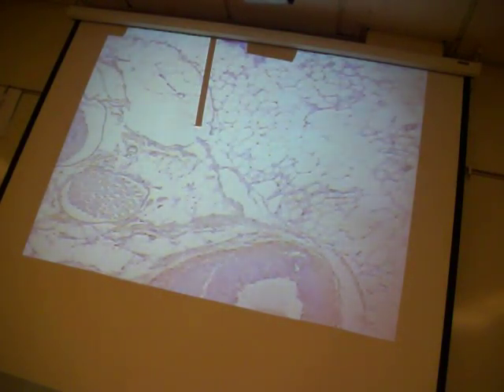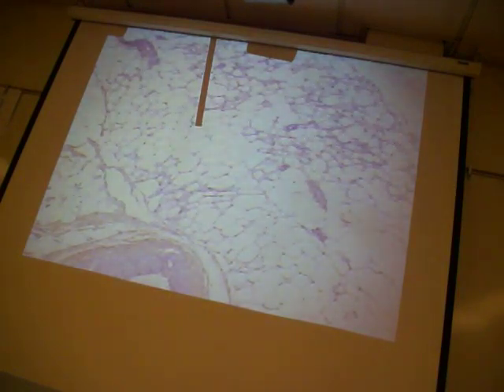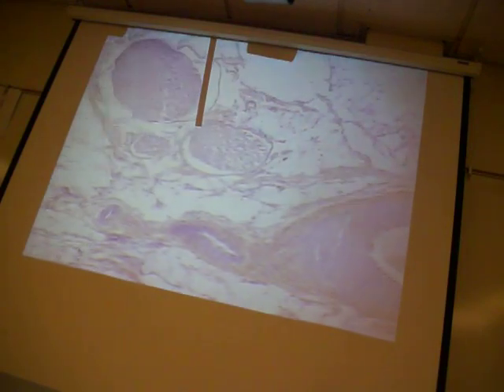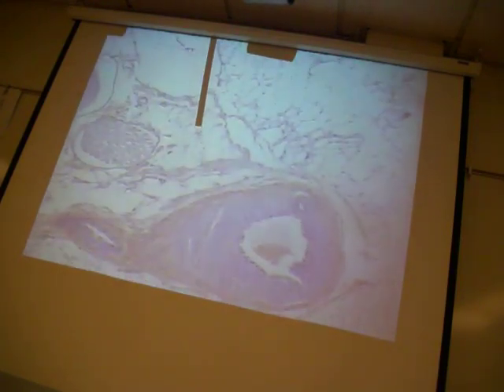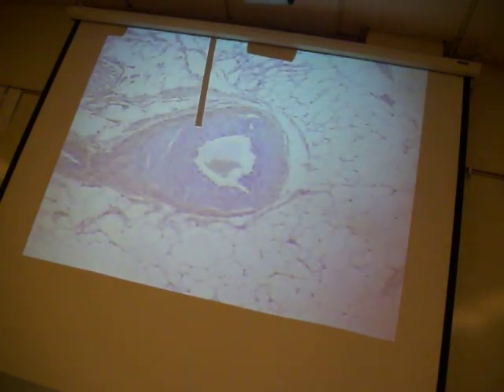Or some of you may have bought, like I know Juan has the photo atlas, right? So you can take a look at the photo atlas, and you can make comparisons. So one of the things here, this slide actually says artery, vein, and nerve section. But notice the first thing that I find on here: here's adipose tissue, here's some other connective tissue, here's a nerve, okay? But what I'm looking at right here is this blood vessel. Here's an artery right here, right?